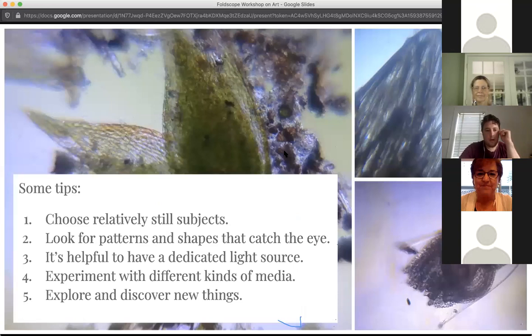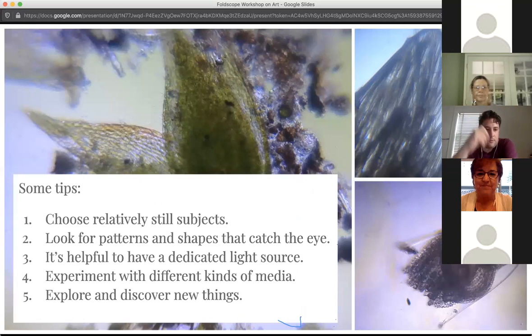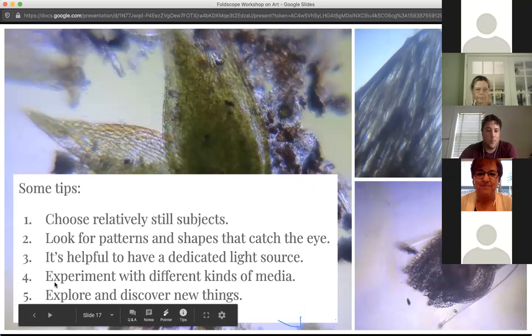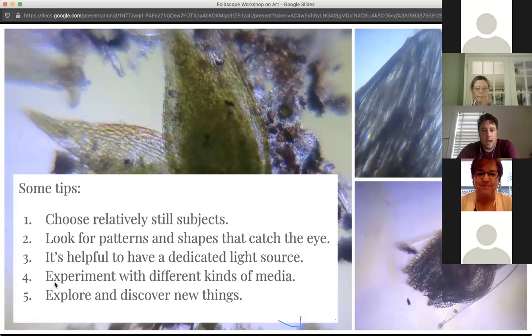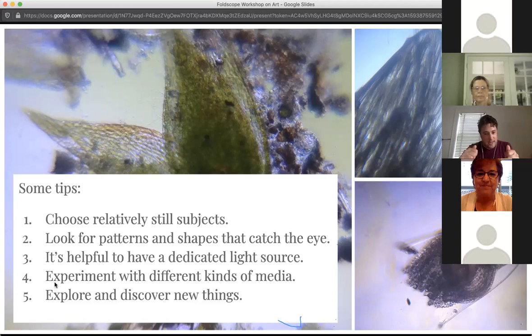A few tips if you want to do this. First, it's really useful to choose relatively still subjects. If you're just starting out, I've had many an afternoon trying to photograph something as quick as a copepod — these really tiny little crustaceans that move faster than lightning through water. It's a frustrating thing to finally get your shot lined up and your focus in, and then your subject moves away. So when you first start out, it's not a bad idea to choose relatively still subjects.